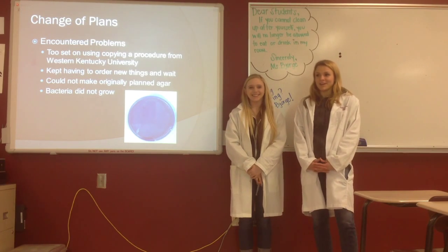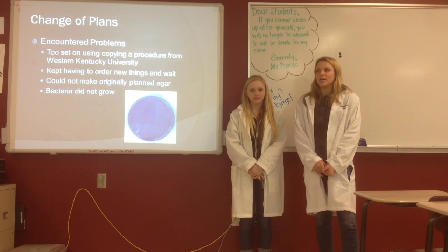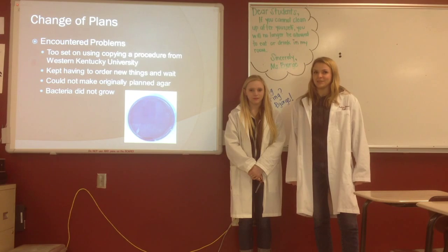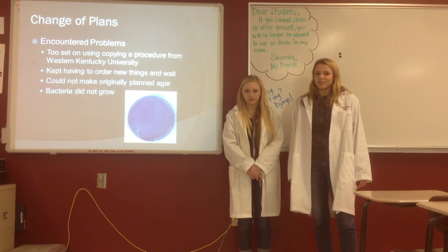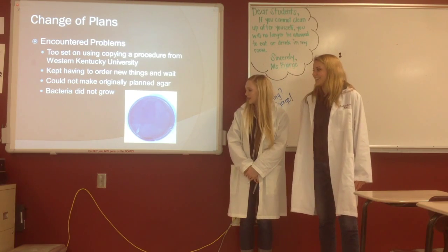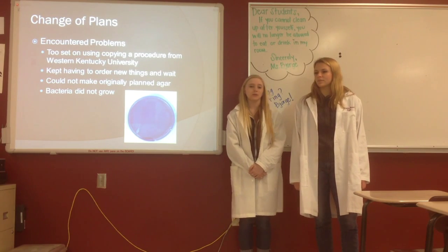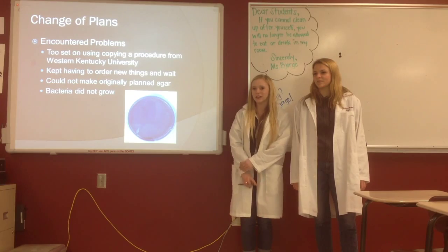We had a lot of problems throughout our lab. First of all, we were way too set on using a procedure we found online through Western Kentucky University. It had all the steps we needed, but we realized pretty soon after we started that we were not going to have the same materials they used, so we had to change almost everything. We kept having to order new things, and waiting for them to arrive took a lot of time, so we didn't get to grow bacteria. Part of the reason our bacteria didn't grow was also our struggles making our liquid culture of M. smeg — we didn't fully understand that we needed to add tween to it to prevent bacterial clumping. So we think that's another reason why our bacteria couldn't grow on our plates.